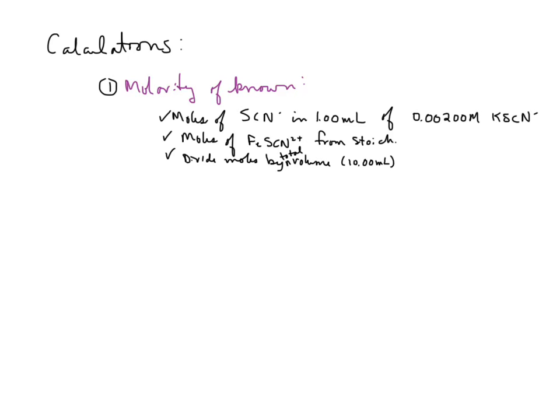Here's the deal. The reason we're using that, turn your attention to the thing we're not using much of. That's the SCN-. That actually is your limited reactant, and we're assuming that the amount of that complex that we're really interested in is going to actually be driven by that limited reactant. It's kind of a technique of dousing it with something and having a smidgen of something, assuming all that smidgen is going to be used up. Actually, calculation 8 looks to see if that assumption is valid.